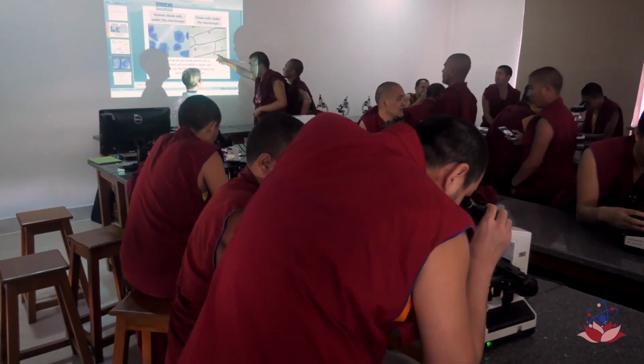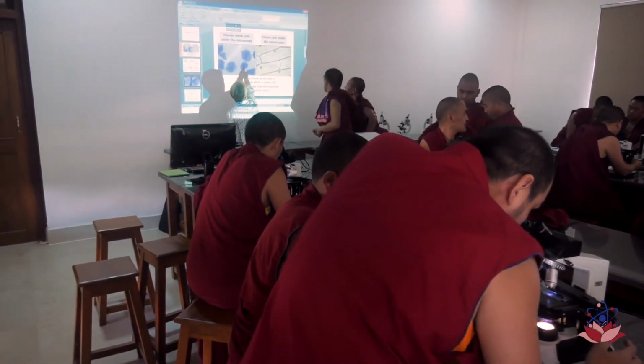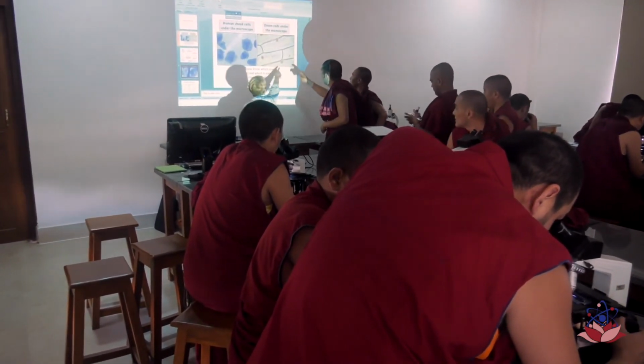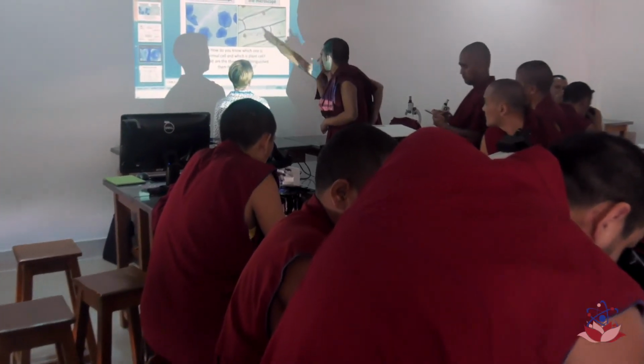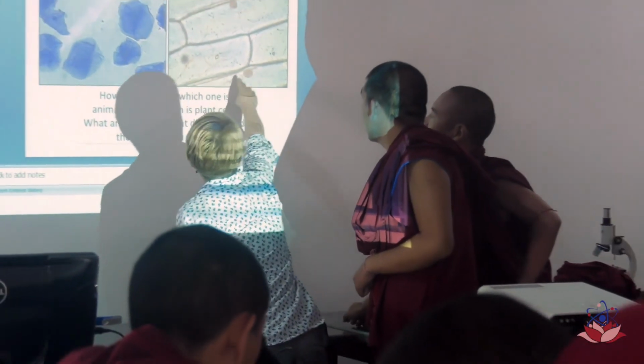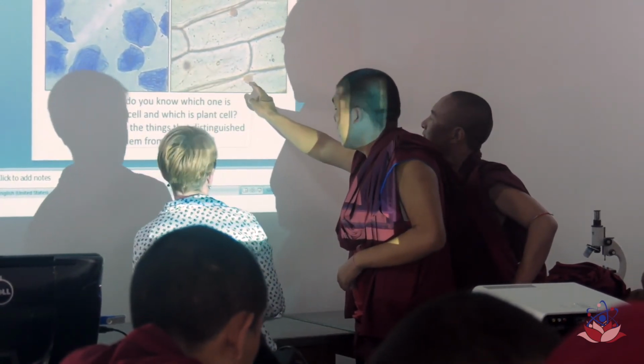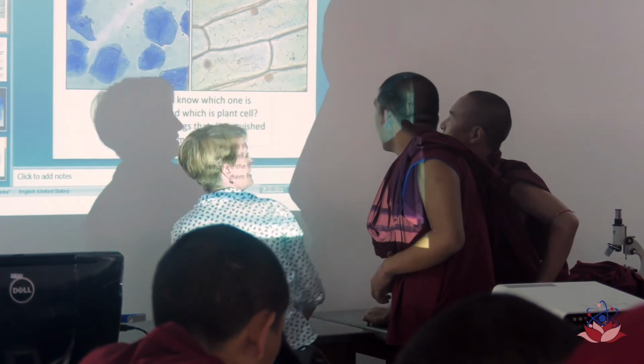Is this a cell? That's the nucleus. Nucleus. It's a DNA cell. Nucleus. What of this? Nucleus. So is this the whole cell? This is the whole cell. That's the nucleus. That's the nucleus. What of this? And that's the nucleus of the neighboring cell.